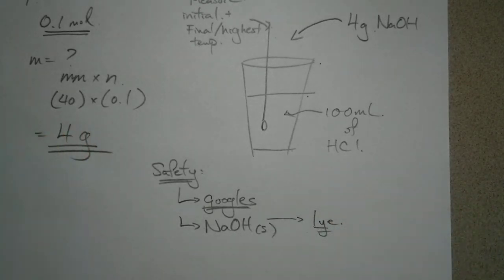People use it to clean things, and back in the days, this is the chemical they used to make soap with when they mixed it with animal fats. It is a very strong substance. It is highly corrosive. If your hands are wet and you touch that stuff, it will give you a chemical burn. Or if your hand has a small cut and it gets on your hand, it could get nasty.